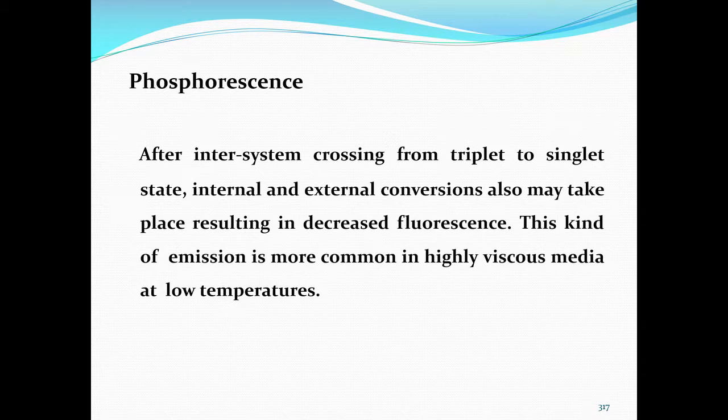And wherever such substances are there, the emission gets reduced, that means fluorescence gets reduced drastically. So, one has to be very careful if you want to apply the system for monitoring of a substance. You should know whether there are such substances like polyvinyl alcohol and some other chemicals which are having an influence of reducing the fluorescence phenomena.